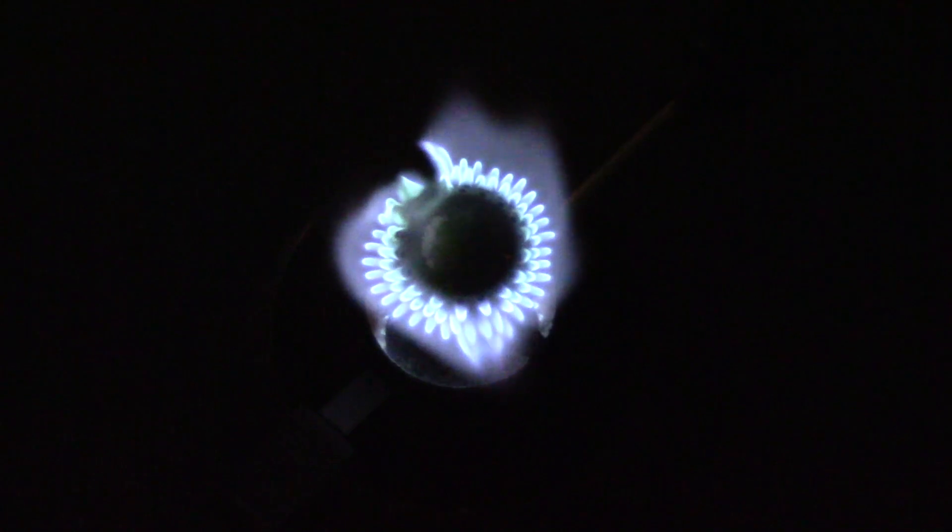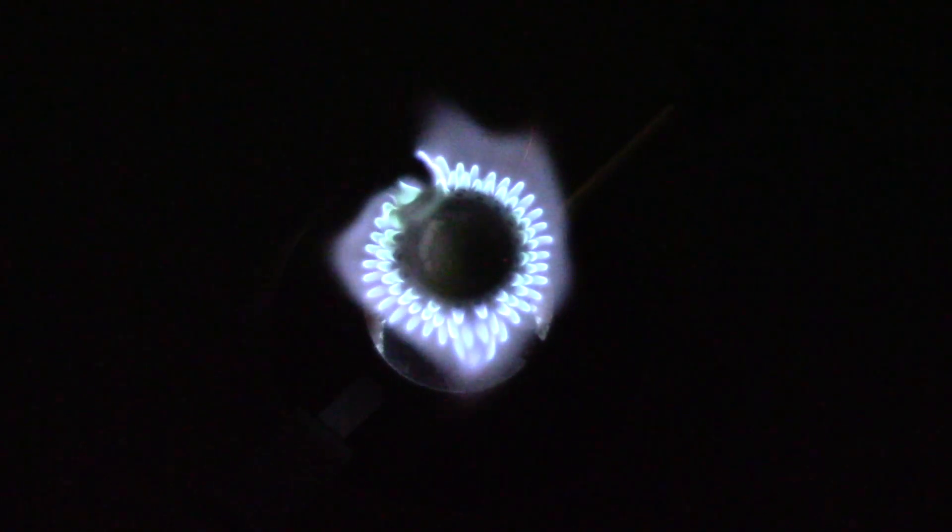I've turned out the lights so that we can get a very good look at what happens when the copper goes into the flame. We should see the characteristic green color that you get from copper in a flame when I put this in, but it's going to go by very fast. If you blink, you might miss it. So here we go.